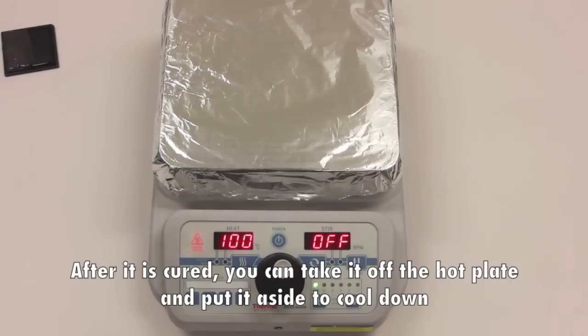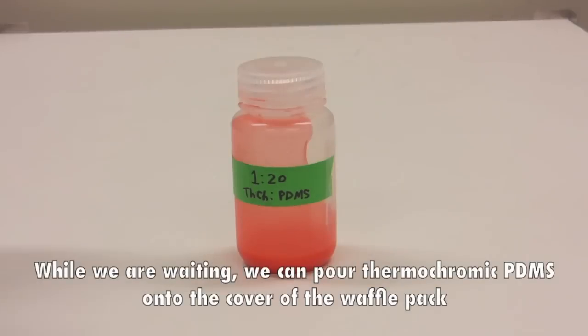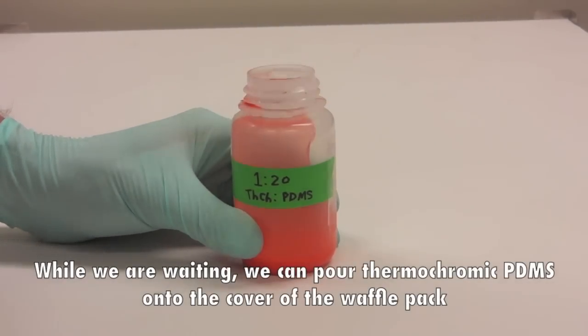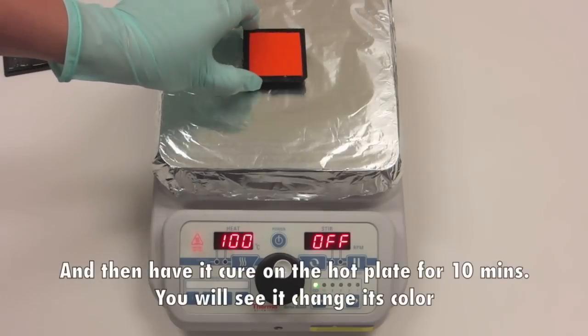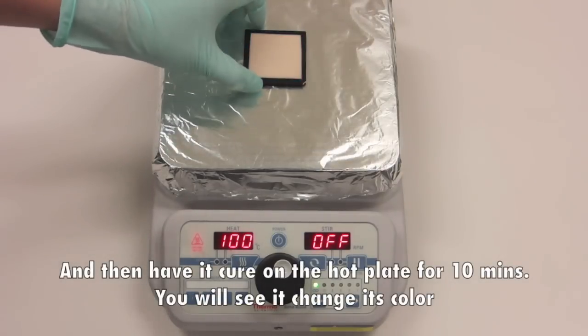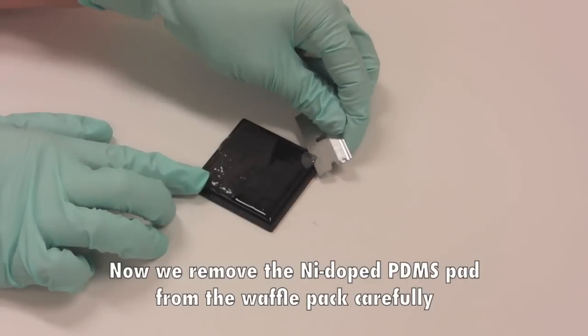While we are waiting, we can pour thermochromic PDMS onto the cover of a waffle pack and then have it cure on the hot plate for 10 minutes. You will see it change its color.